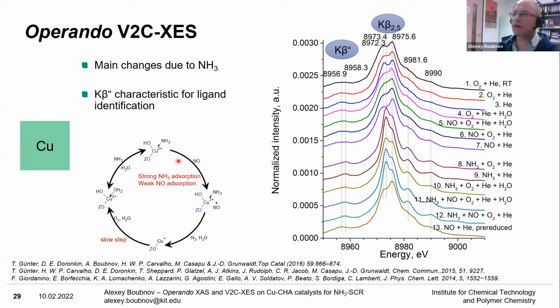Okay, yes, so overlap. If you have coordination of ammonia by the lone pair of the nitrogen, is that the same as having a nitride? I don't know. It'd be fun to have someone run some NWChem calculations on those different small cluster coordinations and see how strong the nitrogen beta double prime would be for a nitride as opposed to having the ammonia there. Yes, I would guess you would have the overall XANES shape completely different, because nitrides are not the same as copper in an oxidizing environment.